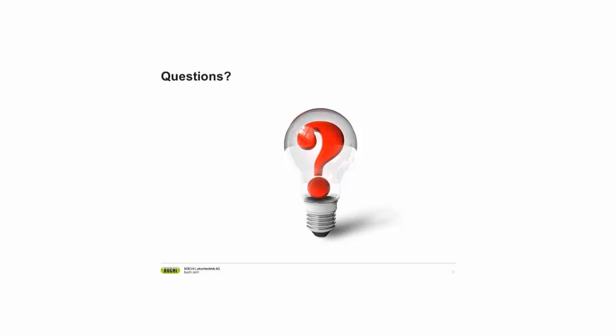Then we have another question about encapsulation, which is, can we encapsulate using this 3-fluid nozzle? If you imagine actual core-shell particles like an egg, we will not be able to do this even with the 3-fluid nozzle. What I always would say is that you use the 3-fluid nozzle if you do not want to use surfactants to stabilize your emulsion, and you have two different parts of the emulsion that are very unstable. Then you can feed them together in the 3-fluid nozzle. They meet at the tip, and there you encapsulate.